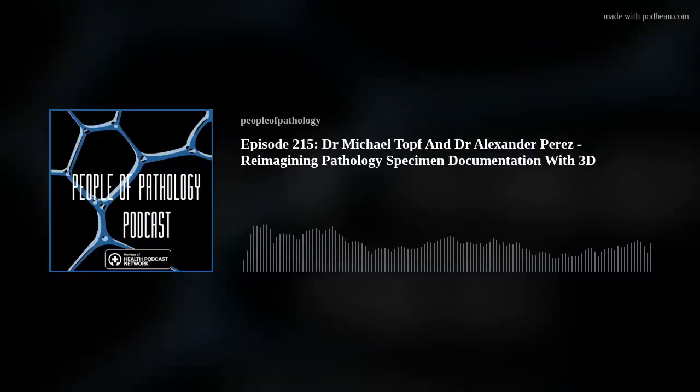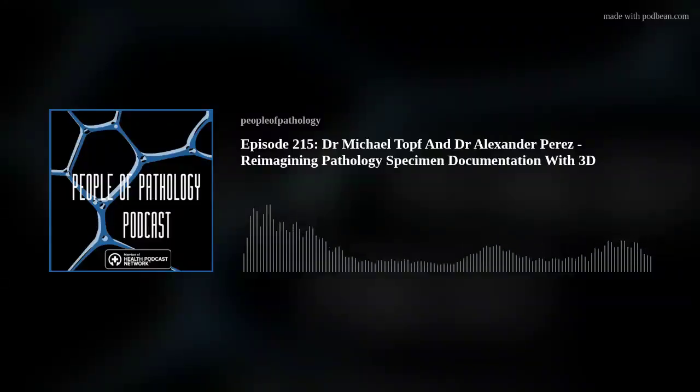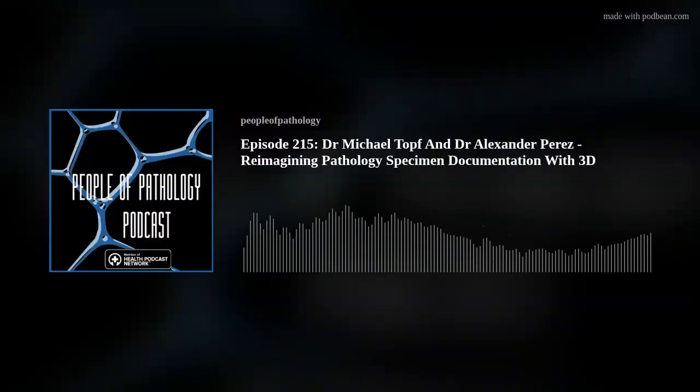Sometimes they'll take some photographs. And then a totally different person who probably never saw the gross specimen is going to sign that case out by looking at the gross description, reading what was written, and piecing it together based on 10 to 20 glass slides that correspond to this description on paper. So there's a lot of opportunity for subtleties and nuances of the specimen to get lost in translation.